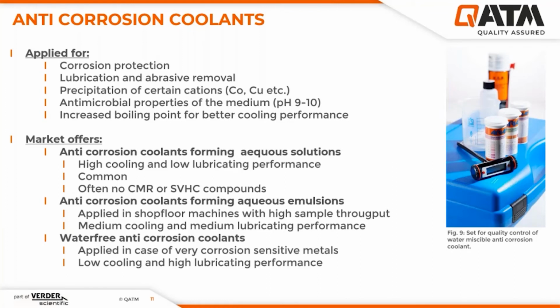In some applications, we also may have water-free anti-corrosion coolants on a cutoff machine. This is only the case if the cut material is so corrosion sensitive that the cutting in an aqueous medium is not possible. We, of course, have very low cooling performance and a high lubricating performance, since we're talking about cutting oils in this case.